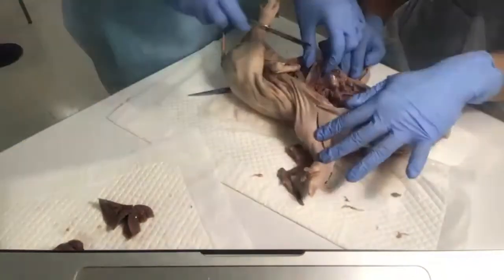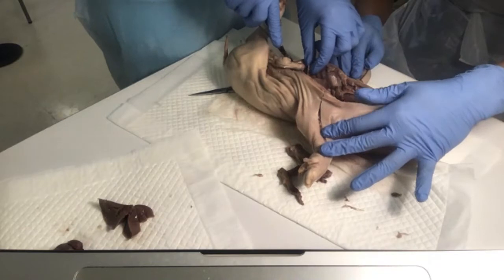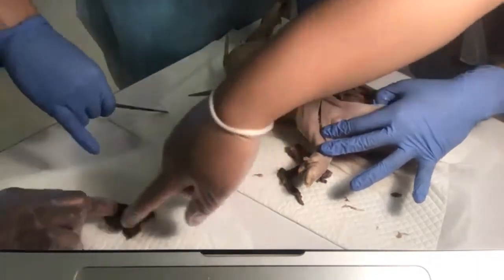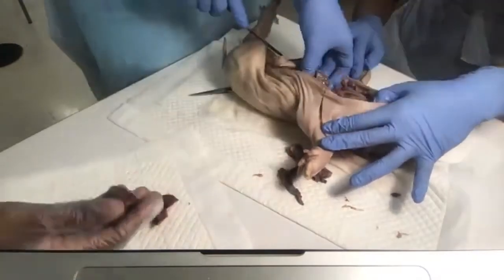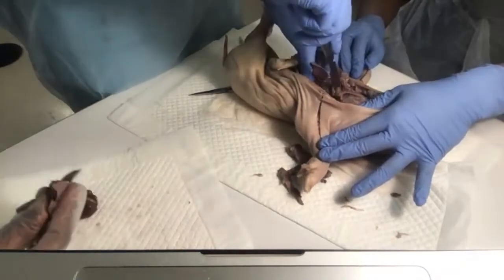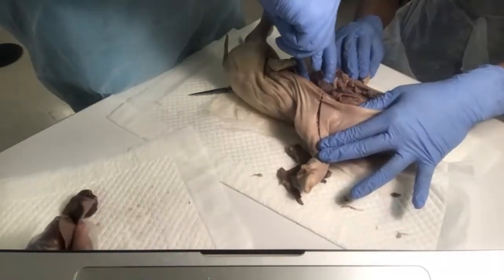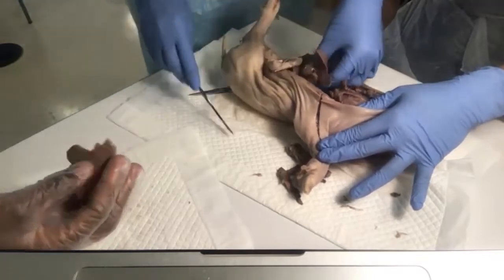Let's cut out the lungs. Oh, good. You cut them out in pieces. No, this is the heart. That's the lung. And also, feel the lung after she cuts it out. The lungs look like the liver. Yeah, it looks like the liver, but it doesn't feel like the liver.